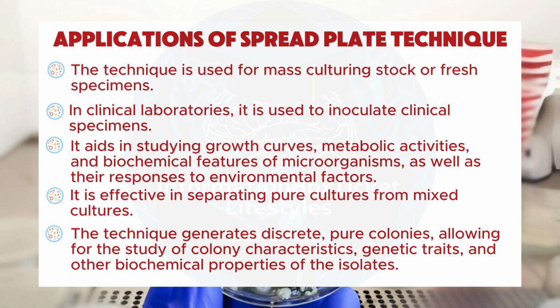The technique generates discrete, pure colonies, allowing for the study of colony characteristics, genetic traits, and other biochemical properties of the isolates.